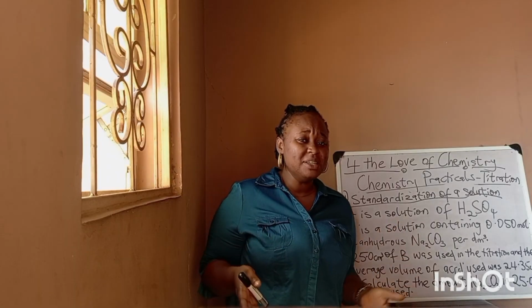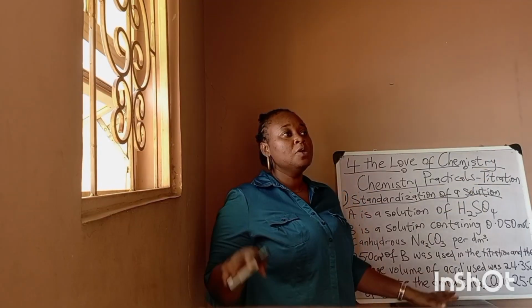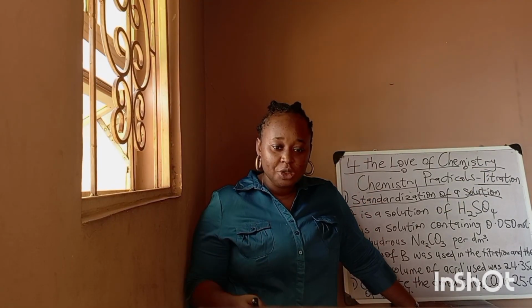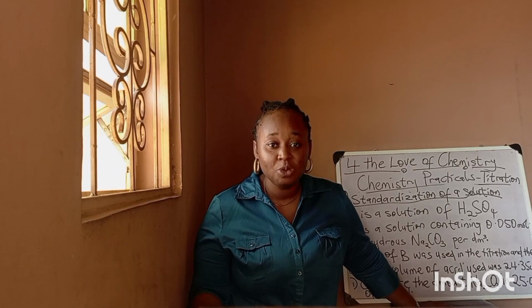There is a reason for titration, and one of the reasons is standardization of a solution. So what do we mean? It implies that with titration, we can standardize a solution. And what does it mean to standardize a solution?